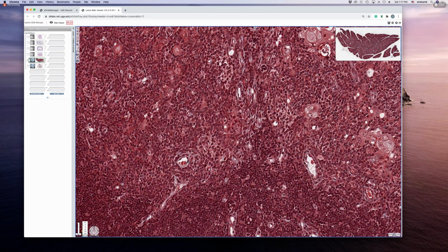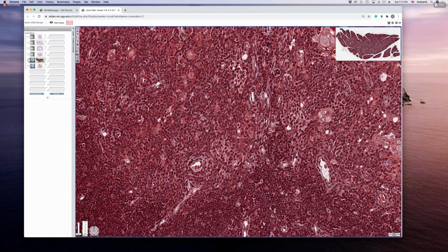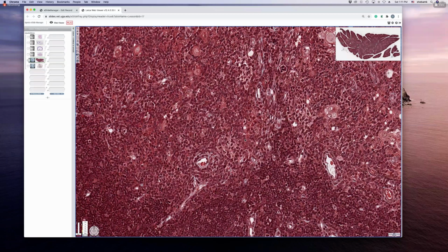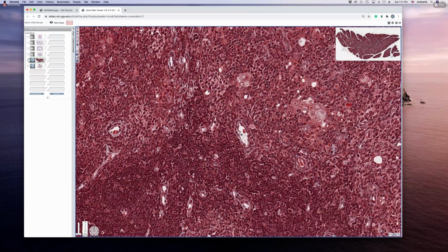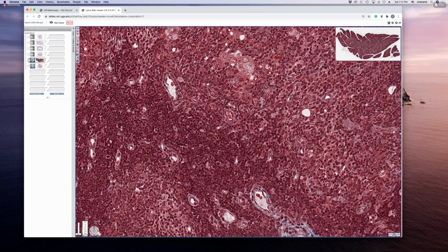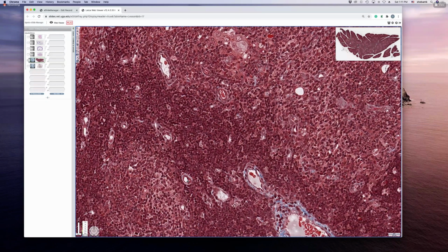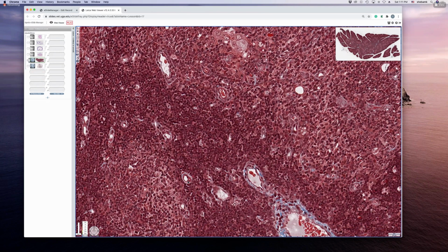So you have all these blood vessels, right? There are capillaries. How do we know that these are capillaries? Because there is only a single endothelial cell lining. So these are all capillaries, and there are three different types of capillaries, right? Do you remember? Fenestrated, continuous, and discontinuous. Awesome.